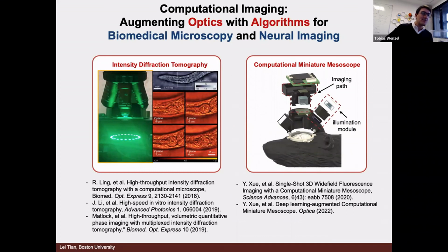I was just wondering, you used mainly low refractive index contrast samples, and in the end you showed a reconstruction for higher contrast samples, but they were not absorbing, right? What happens when you have slightly absorbing objects? Is that a real problem?